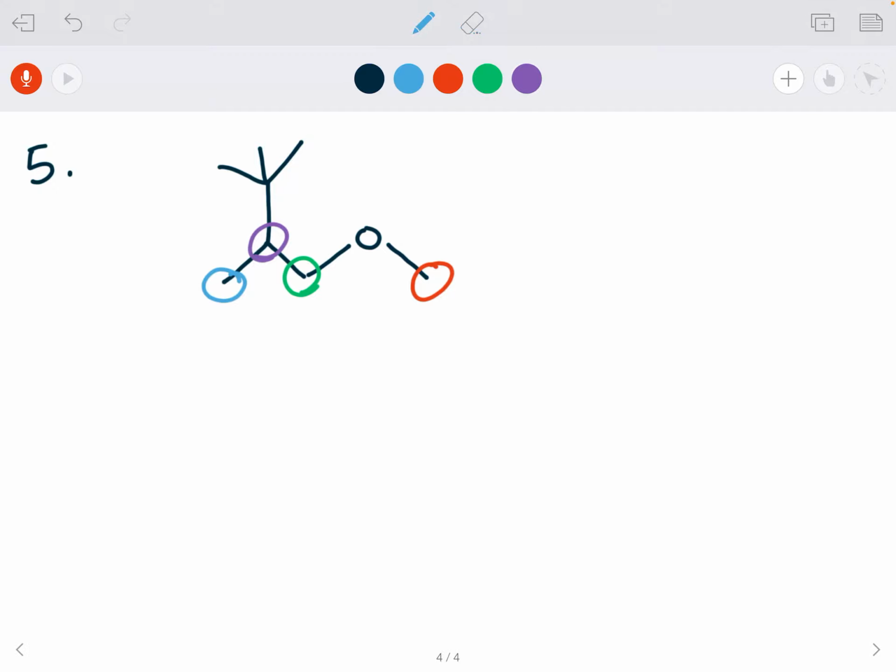And then I'm going to get a new color. These are all the same signal because they're bonded to the same carbon and none of them are bonded to anything else. Right? If I drew in, say I drew in one thing, so now we had an ethyl group here and then just 2 methyl groups, this would be its own signal and that would be its own signal. But because all of them are methyl groups, they are all the same chemical signal.